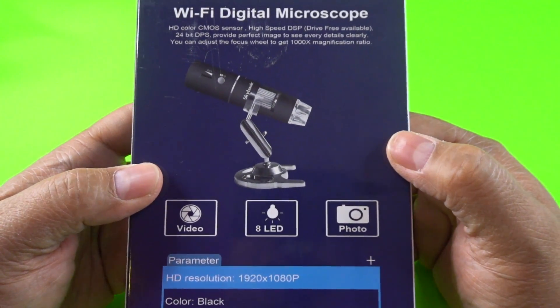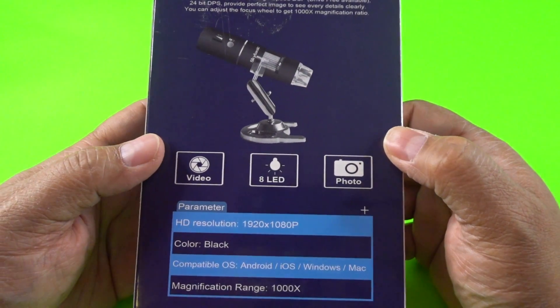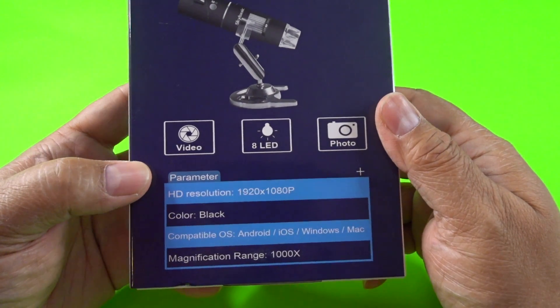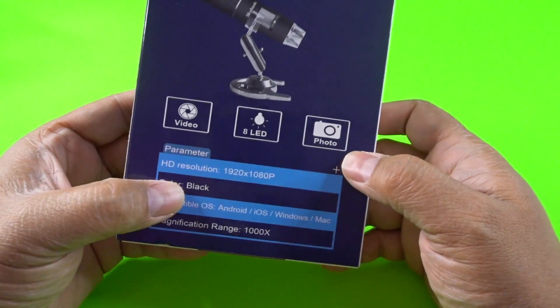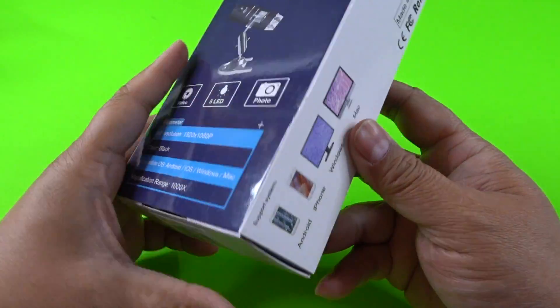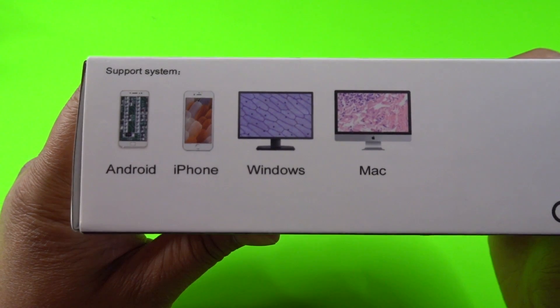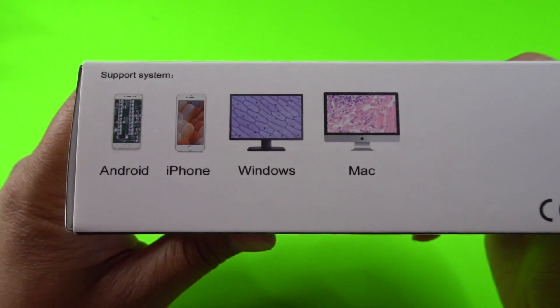It features video recording in 1080p. It also can take pictures. It's got eight LED lights at the tip to light up your subject. And it has up to a thousand X magnification. I'm not sure if you will really get a thousand X magnification but as long as we come close to it that should be fine.